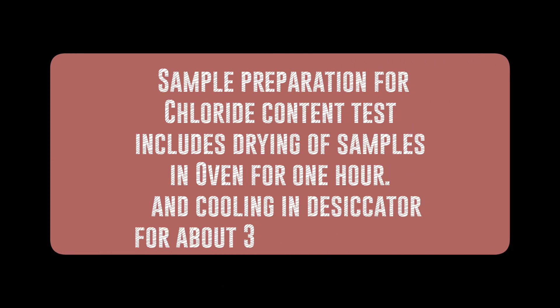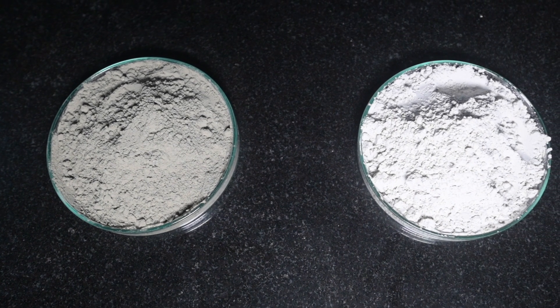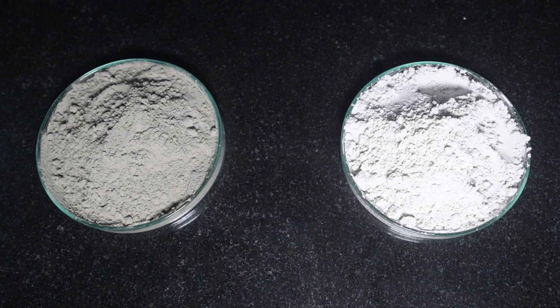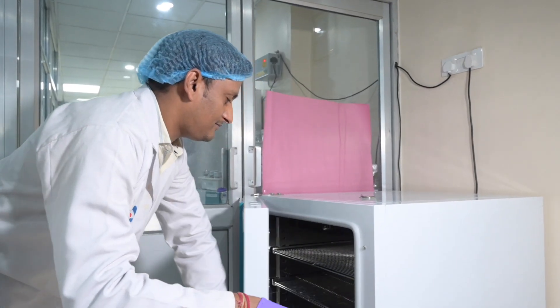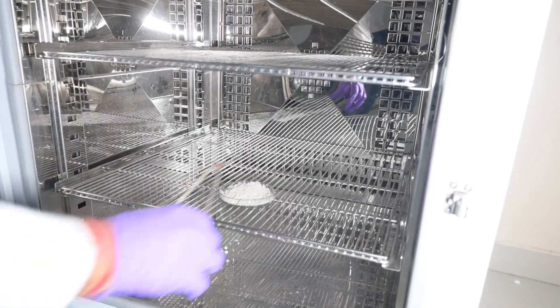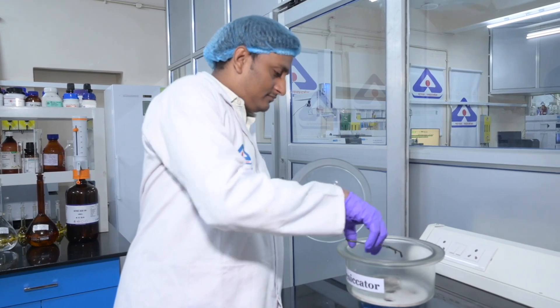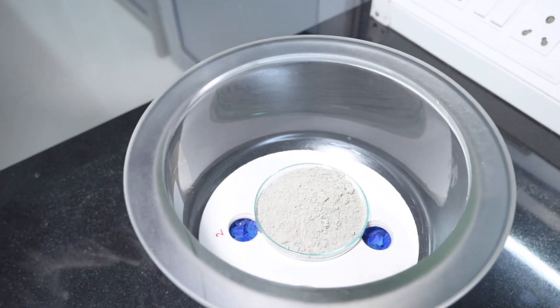Sample preparation for the chloride content test includes drying of samples in the oven for 1 hour and cooling in a desiccator for about 30 to 40 minutes. Keep about 10 grams of sample in a large glass petri dish and spread it evenly into a thin layer. Put it in the oven maintained at 105 plus or minus 5 degrees Celsius for 1 hour to remove any superficially adsorbed moisture. Take it out, keep in a desiccator for about 30 to 40 minutes, and cool it to room temperature.